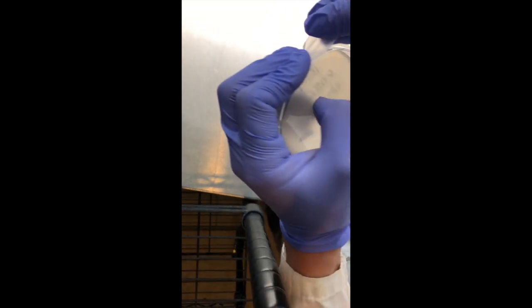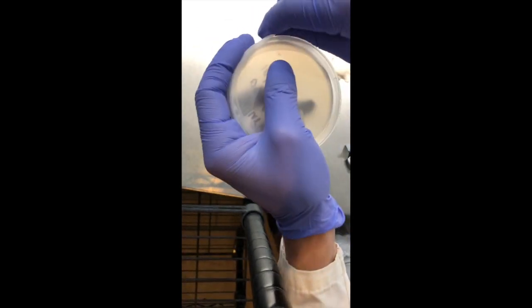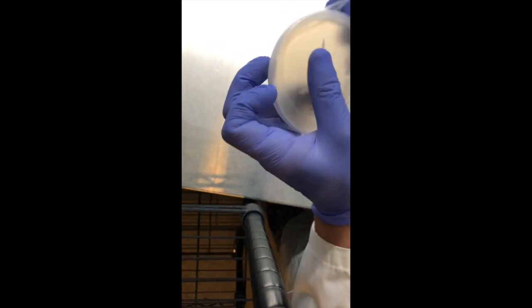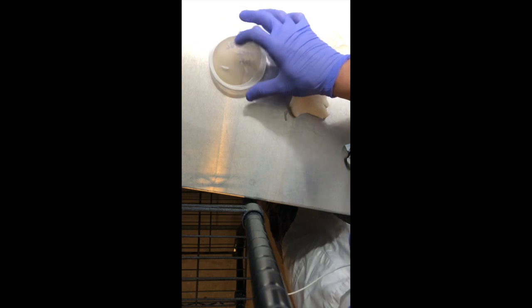Now I'm going to apply some parafilm on the petri dish. This is a wax coating that helps retain moisture inside and also protects from contaminants. After I wrap it up and label it, I'll stick it in the incubator until it colonizes the plate.